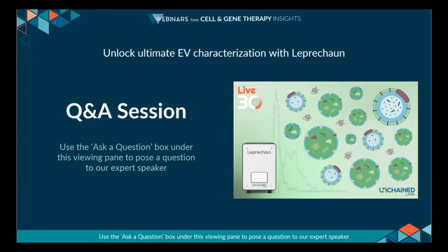If you're looking at a very rare EV subpopulation, then sometimes it can be beneficial to do a cleanup step beforehand. But I would say you always run your sample first, see if you're getting good positive signal, and if you are, you don't need to clean it up. There may be occasional instances where that cleanup step can slightly help you.